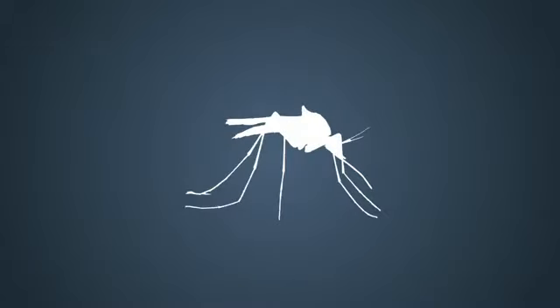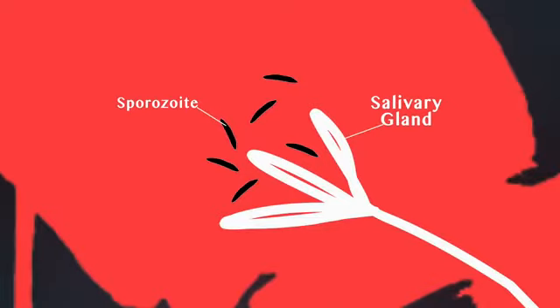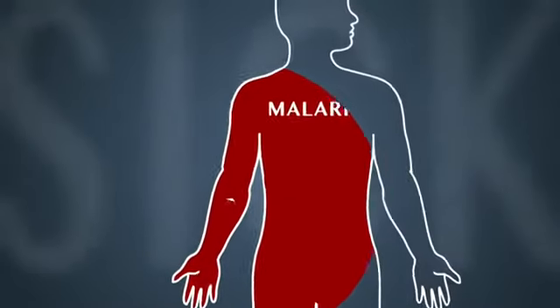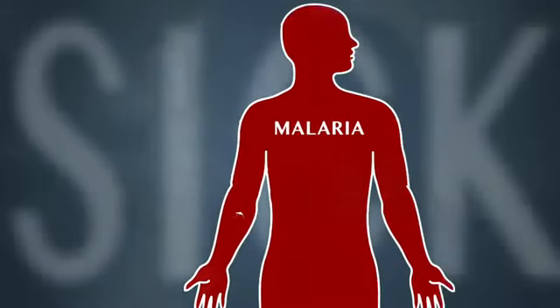If a mosquito is infected, sporozoites can be seen around their salivary gland under a microscope. These parasites get passed from the mosquitoes into the human bloodstream through their bites. And that's how people become sick with diseases like malaria. And basically what they look like under the scope are tiny little eyelashes. And we're looking for a decent number to make sure that you were infected.